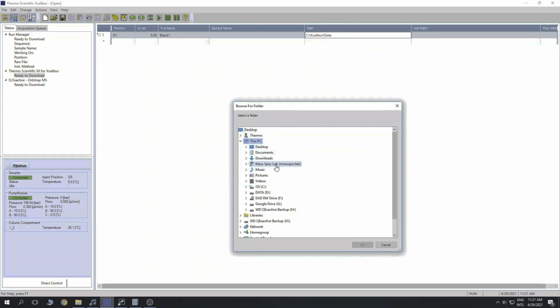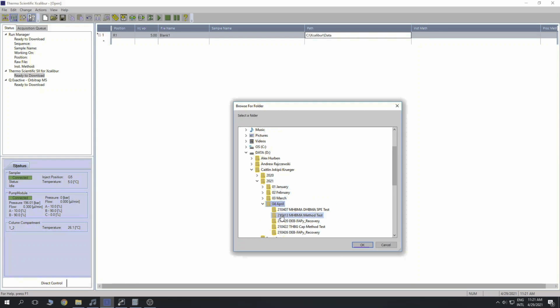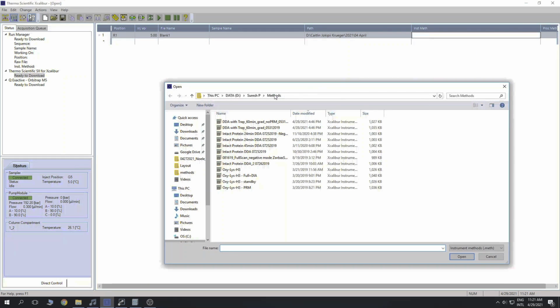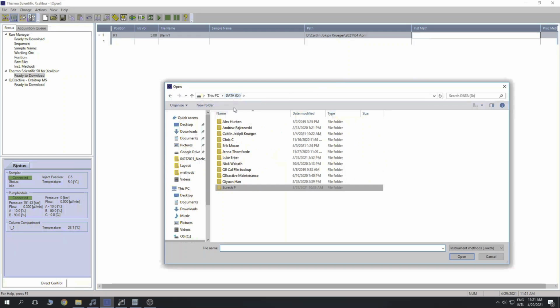You want to select the path where your data will be saved. So right-click, Browse, and then we save the data under the D drive here. So you'll want to choose your folder and find an appropriate place to save your data. So for now, I'll just save it in my April folder.